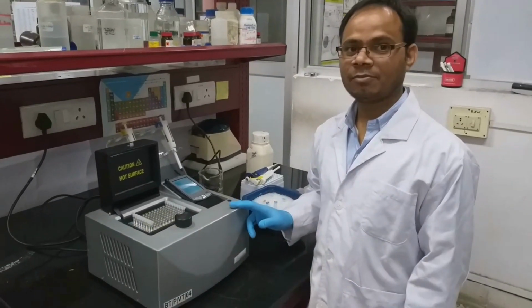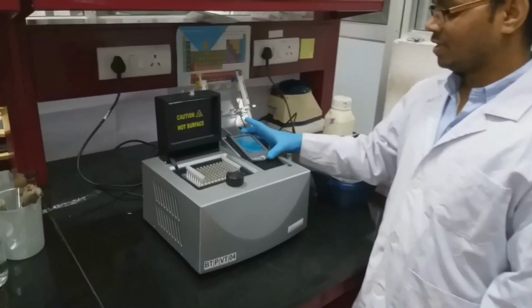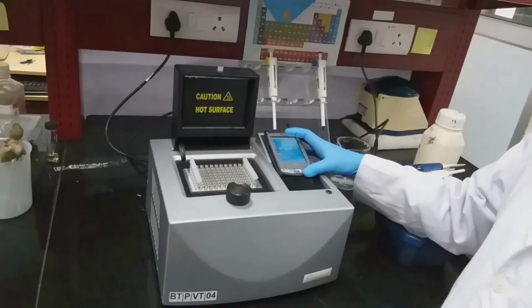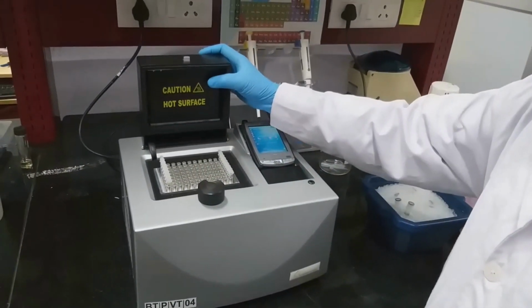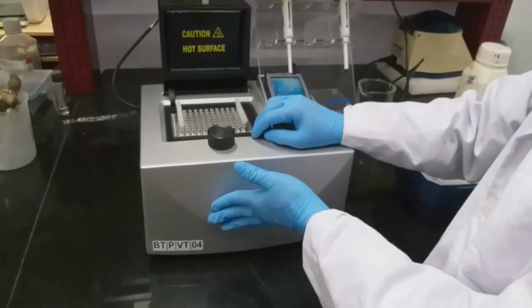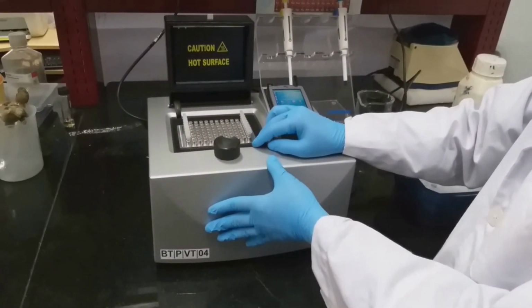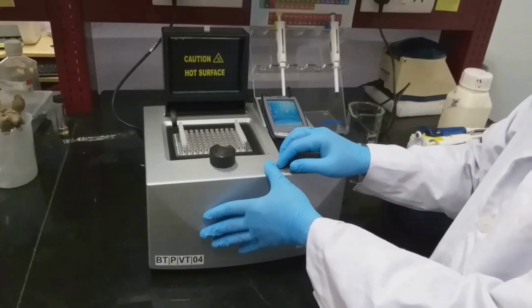This is an earlier version of a thermal cycler which contains a display unit where we can observe and change the parameters. This is a hard shield. This is the sample holder, and inside there is a Peltier system which can maintain the temperature fluctuations.